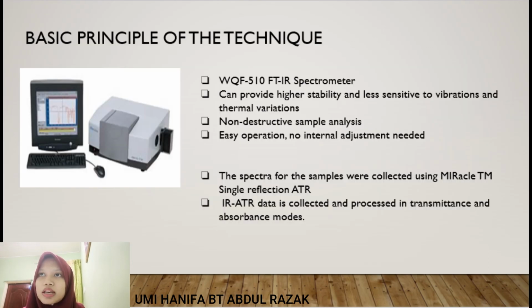Basic principle of the technique: the WQF 510 FTIR spectrometer can provide higher stability and is less sensitive to vibrations and thermal variations. The spectra for the samples were collected using the MIRacle Single Reflection ATR. IR data is collected and processed in transmittance and absorbance modes.